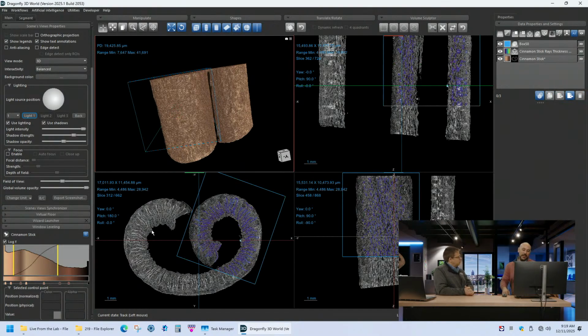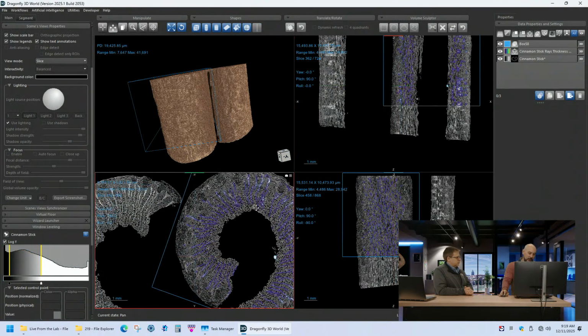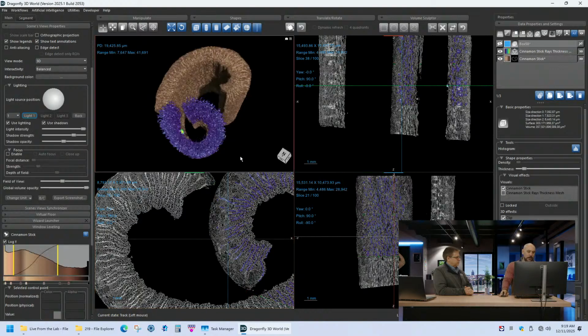You have your tree rings, your growth rings, and then the rays cut across the growth rings, and they help bring nutrients to the entire tree. So I thought it would be interesting to quantify these rays, to extract these rays and visualize just the rays. And that's what we did. But then we thought, you know what, it would actually be really cool to apply a thickness mesh to them. So that's what we did.